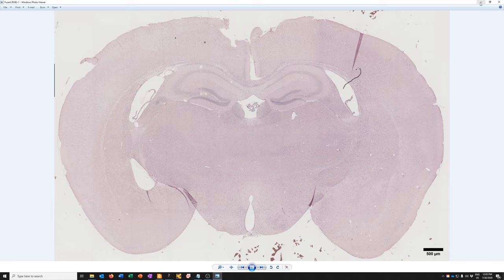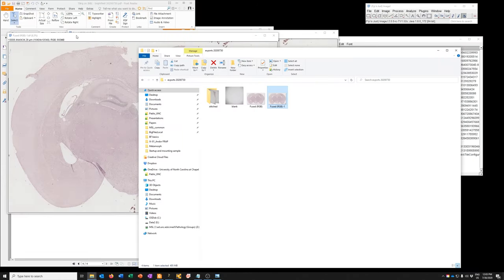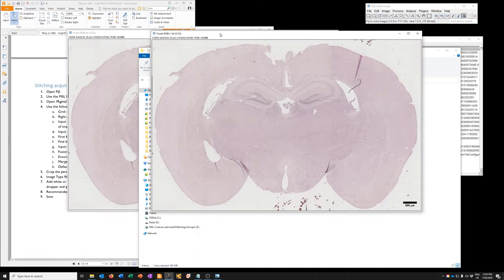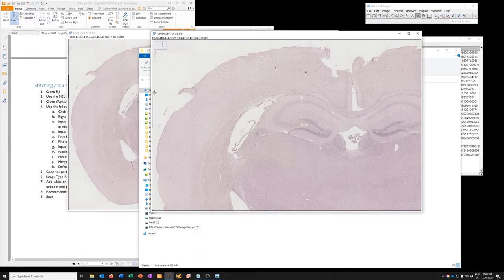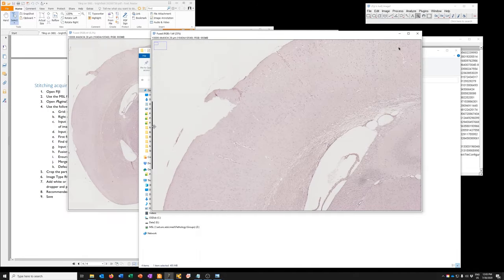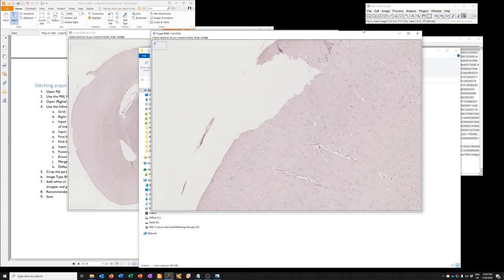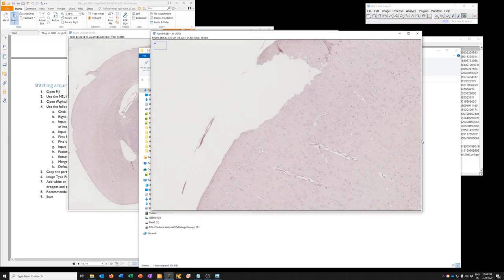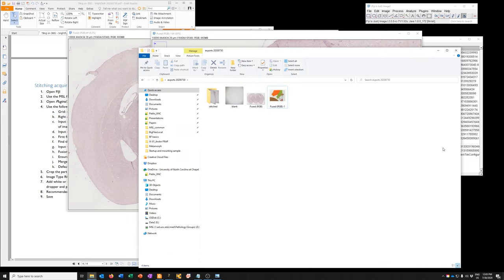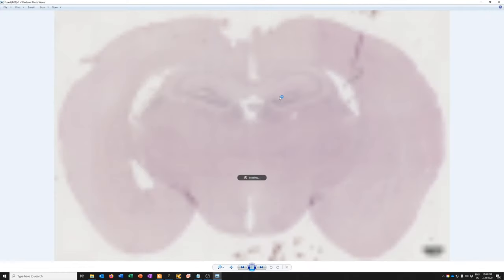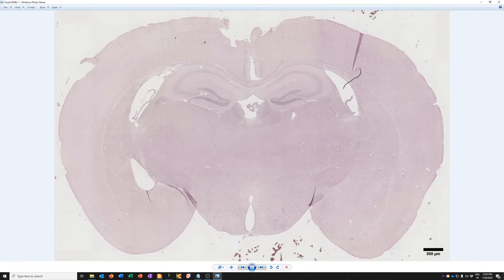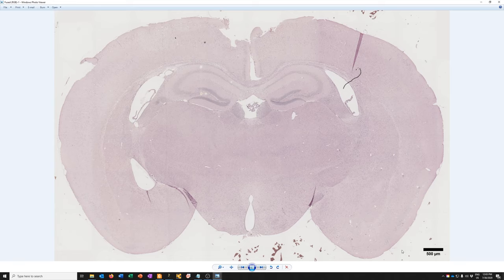We forgot one other thing, which was to deal with this. And so I can use the paint can again. It's just a one pixel strip. There we go. I'll just save it again. Replace it. There it is. And if I double click on it, you can see that's gone. Everything looks good. Okay.